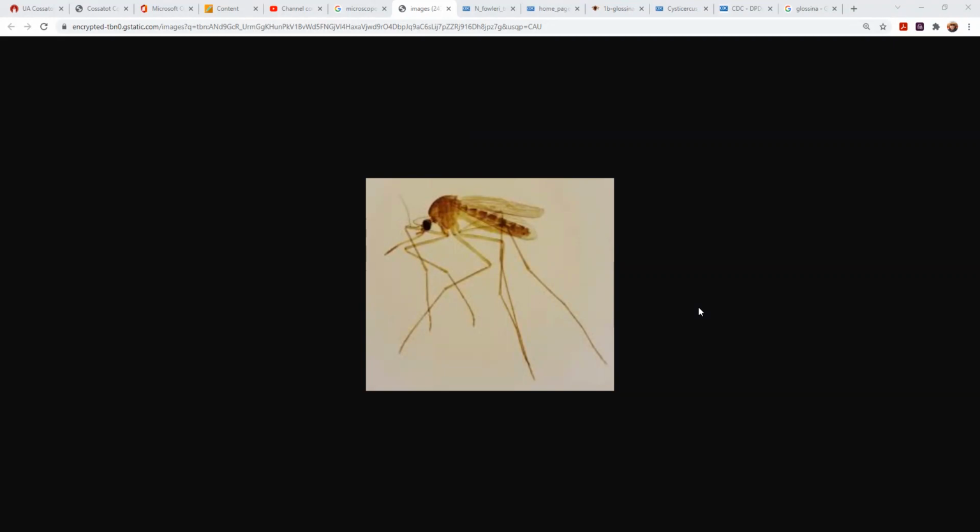You'll notice this one looks different from the Aedes and the Anopheles mosquitoes that we observed in Lab 24. Culex is typically brown. They are smaller than the Aedes and Anopheles mosquitoes. Their antennae are not typically as long. And Culex mosquitoes spread a variety of different diseases, but the most prominent and well known and probably well studied is West Nile virus.